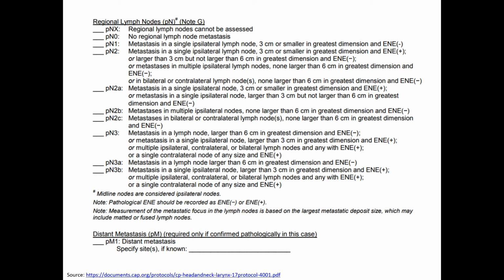So, what's the clinical impact of a positive margin? And does that differ from a close margin? Yeah, that's a great question. So, at frozen section, most of the time, any margins are going to be dealt with at frozen section. And if it's positive at frozen, depending how much room the surgeon has to go back, they'll go back and try and give you a new margin as best they can.